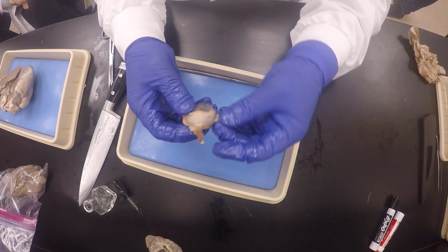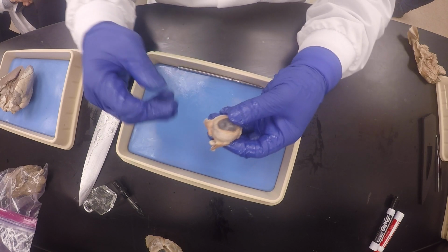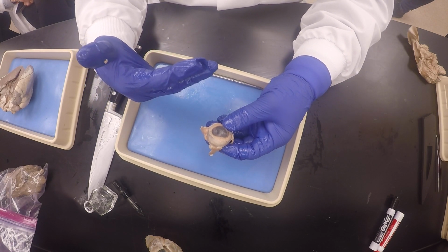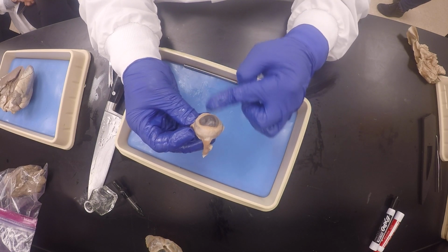You know, we found a good eye. We got lucky. So remember what I said last time. In order to identify the sides of the eye, you need to look at the short side. Okay. We look at this short side. See, this is the short side. There's the short side. There's the long side, and there's the long side.